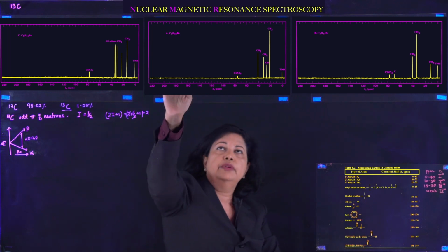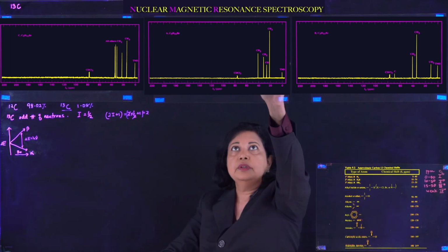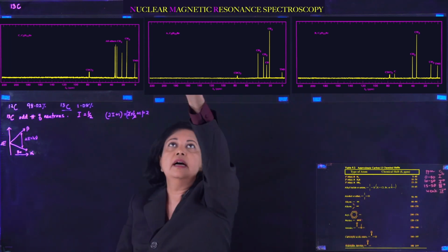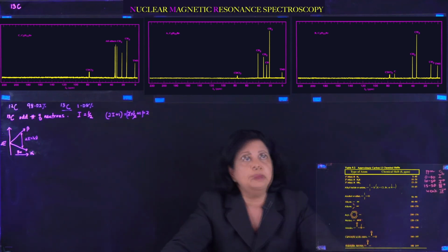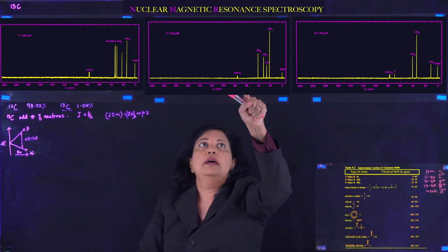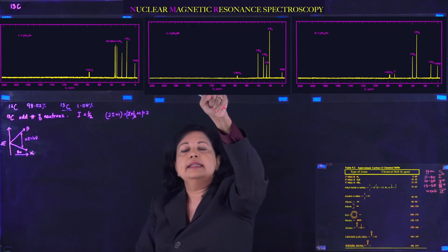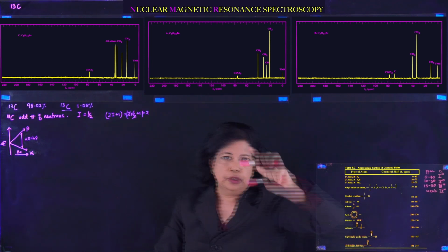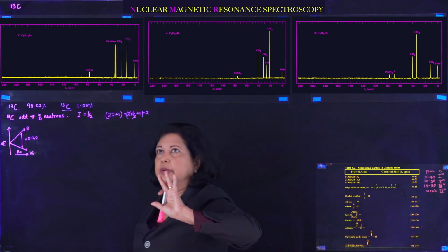Over here, you would find your carbonyls. So alkyl groups, alkenes, carbonyls. That's pretty much the region. Your triple bonds are actually 60 to 90. So the triple bonds would be in between the alkyl, sp3, and the alkene, sp2. All right. So those are some regions to remember.